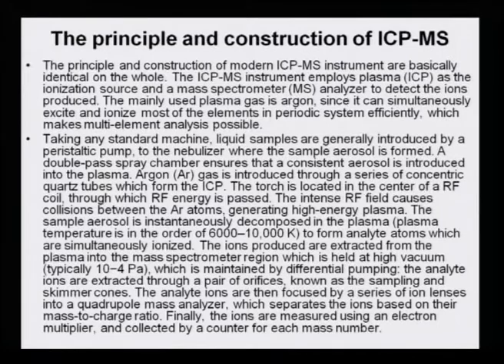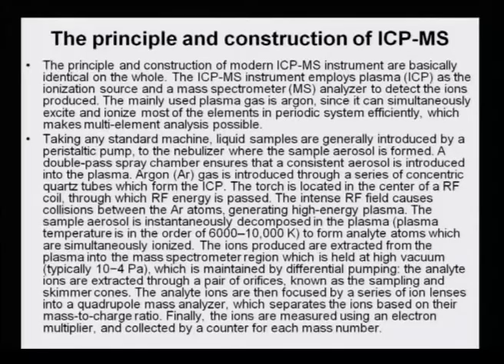So, what is the advantage of using the argon plasma? It is because it can ionize and excite many elements in a multi-element system very easily and efficiently. Taking any standard machine, liquid samples are generally introduced by a peristaltic pump to the nebulizer, where the sample aerosol is formed. A double pass spray chamber ensures that a consistent aerosol is introduced into the plasma.